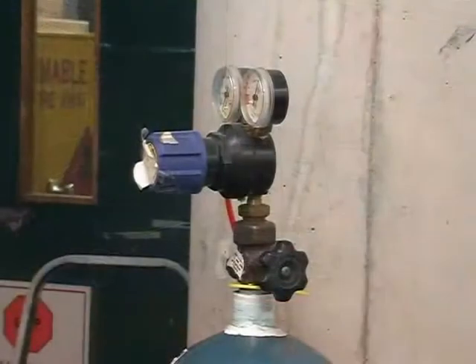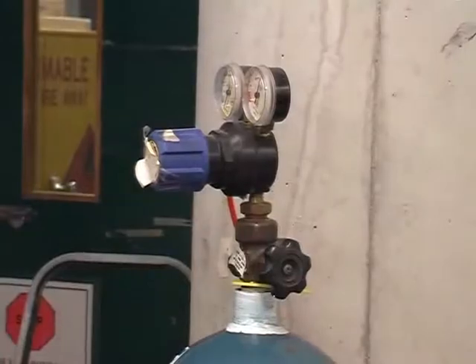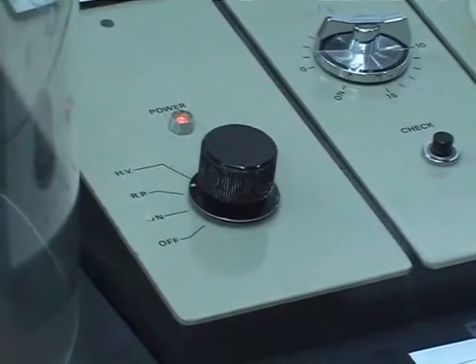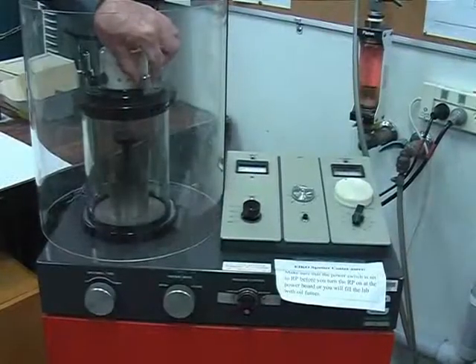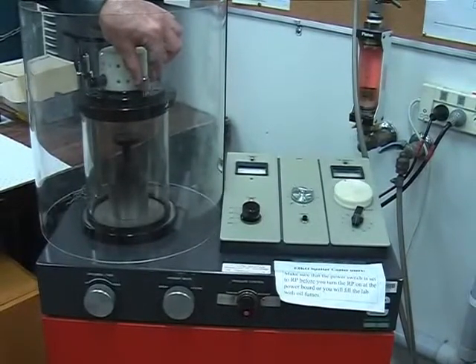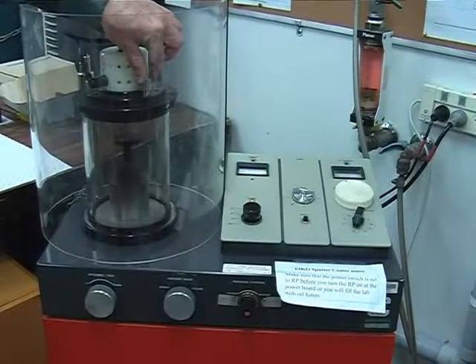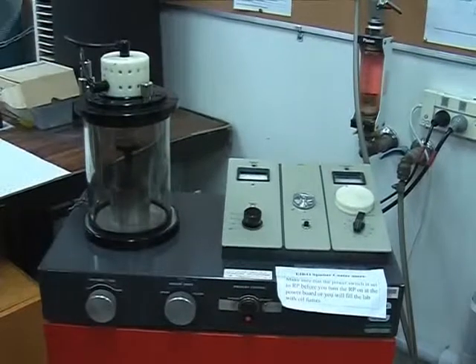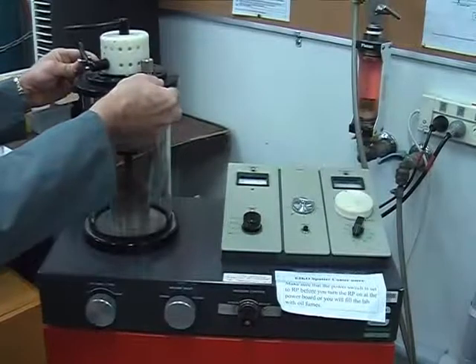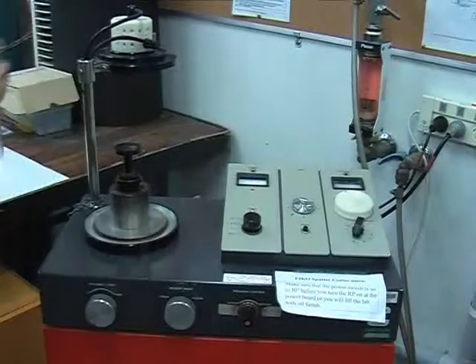Turn off the argon gas cylinder and return to the sputter coater and set the power dial knob to RP. Next, vent the chamber slowly at a rate that is just audible. When venting is completed, remove the safety shield, lift the black lid and rotate it backwards to secure it in the locked position. Remove the chamber glass and finally remove the specimens and place them safely in a specimen holder.